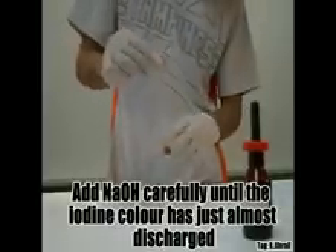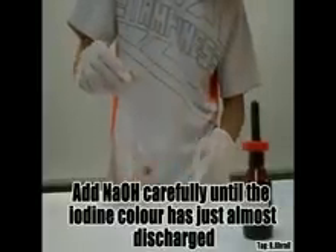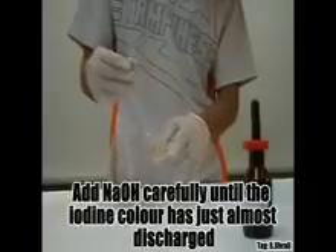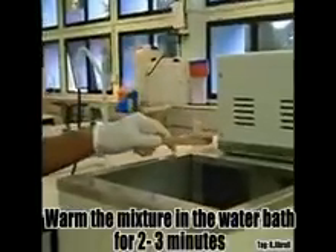This is not the correct way to mix the mixture — do not knock the test tube. Warm the mixture in the water bath for 2 to 3 minutes.